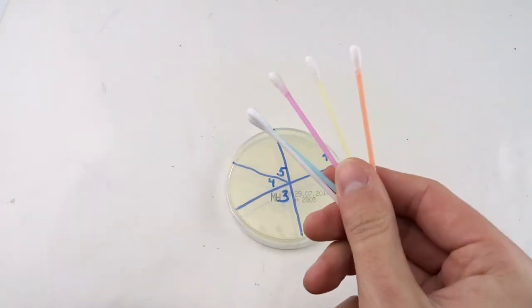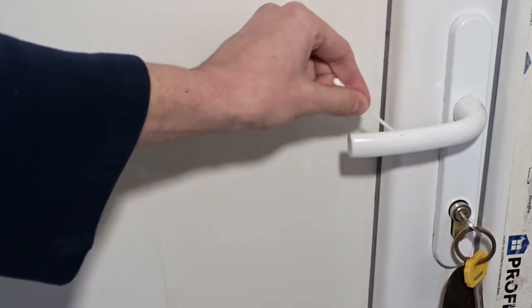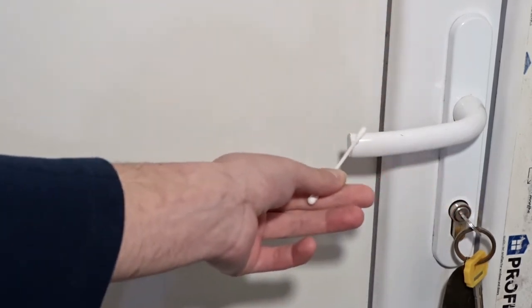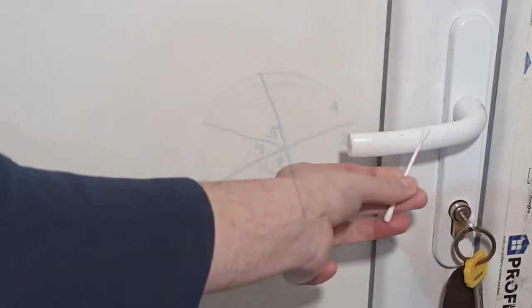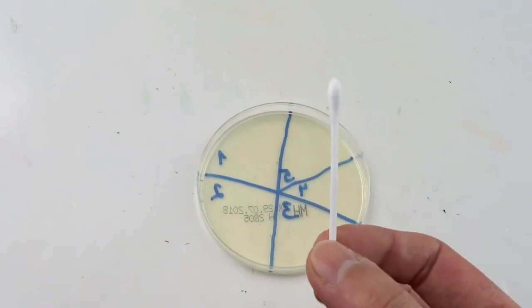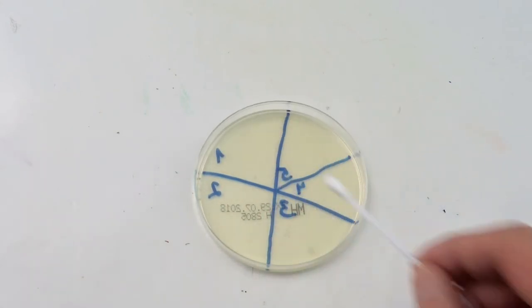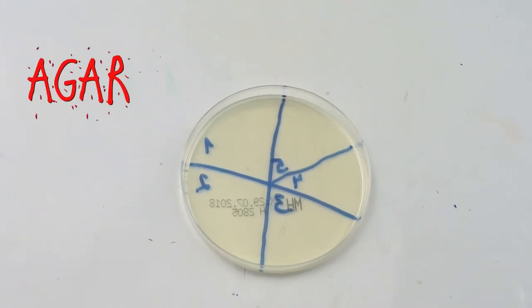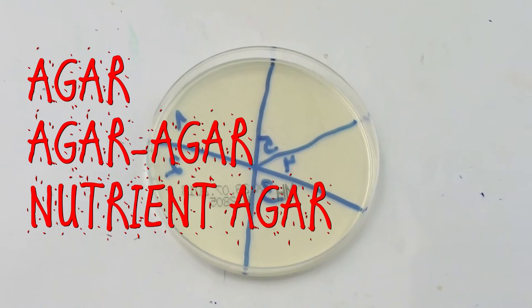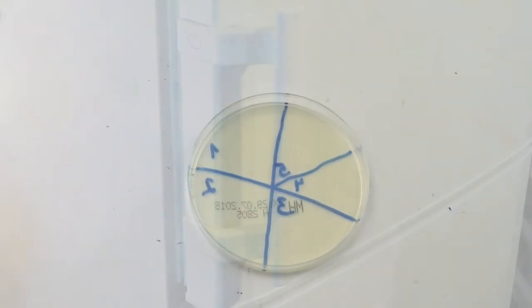Now get some clean cotton swabs and let's collect our samples. The first sample will be from the door's handle. You need to rub the cotton swab onto the surface. Now open the cover and gently rub the swab onto the jelly-like substance on the bottom of the Petri dish. It's called agar, or agar-agar, or nutrient agar. You can buy it from the bio stores and make your own Petri dish.